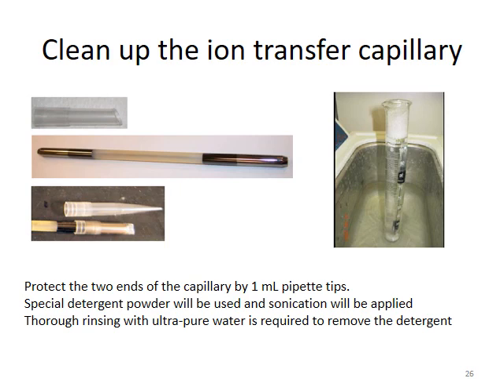To thoroughly clean up your capillary ion guide, what you can do is firstly protect the two ends of the capillary ion guide with 1 ml pipette tips.